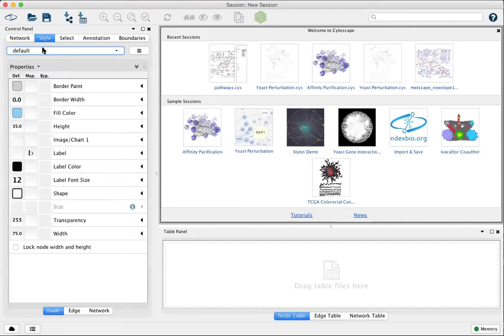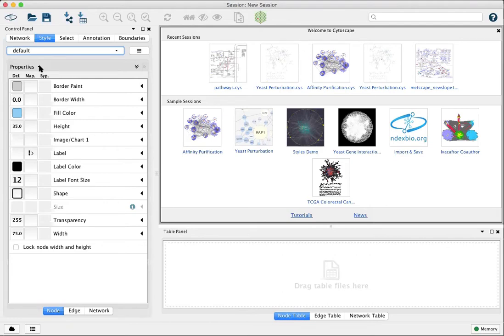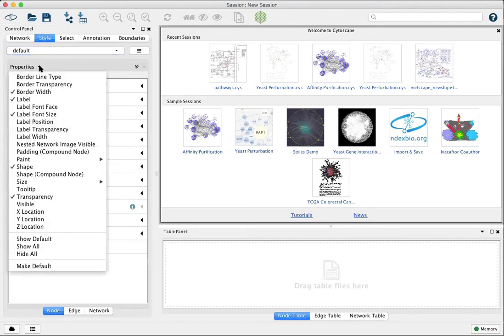Here you'll see the normal set of default style properties, visual properties. Under this properties pulldown, however, there are additional properties that you can set.